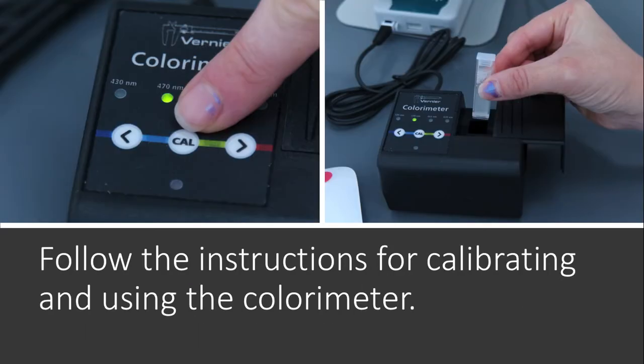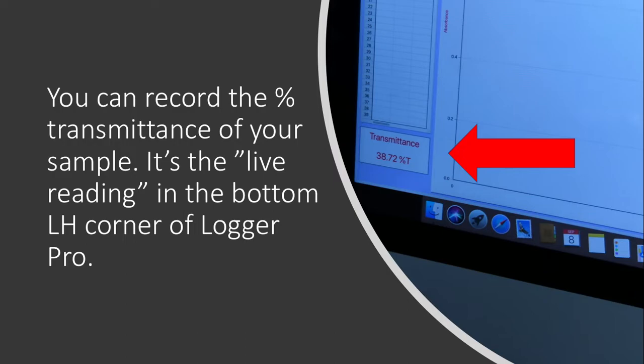So this is your colorimeter right here. You always need to calibrate it before using it, and that's what this slide talks about. And this second picture over on the right shows us how we put the cuvette inside of the colorimeter. So if you were doing this in person, we would do it in Logger Pro, very similar to what we did with the ice and ice water experiment. But we're just going to use it for its reading.